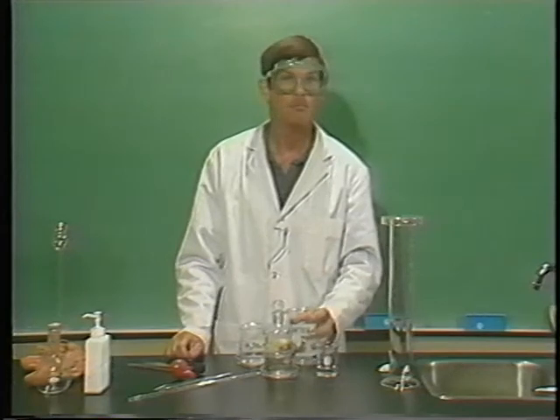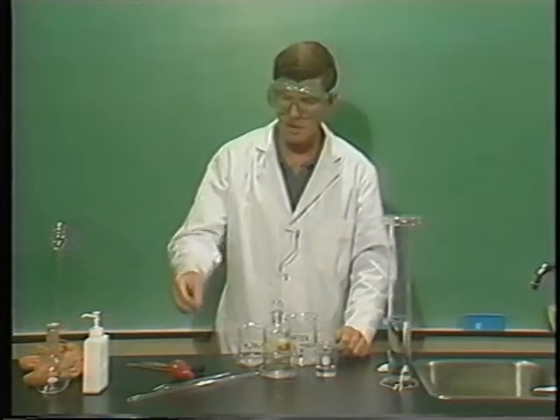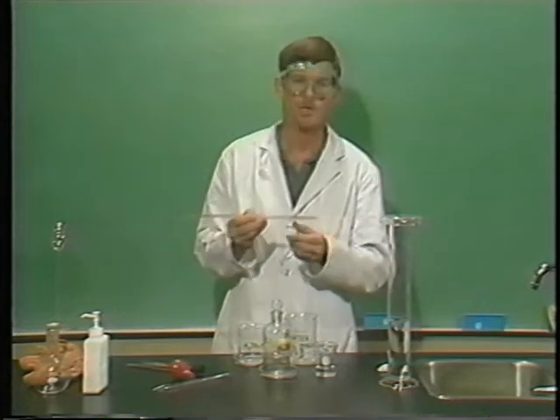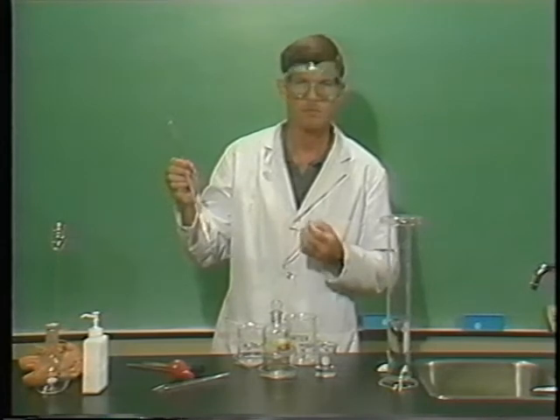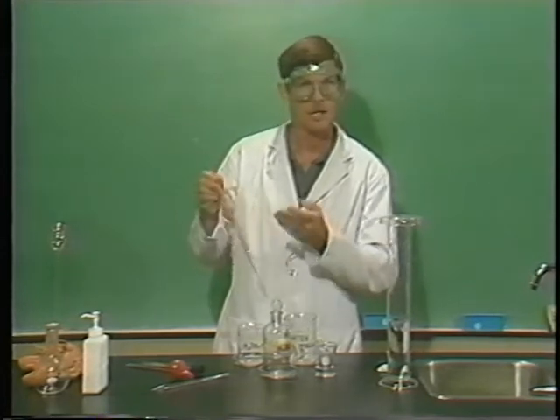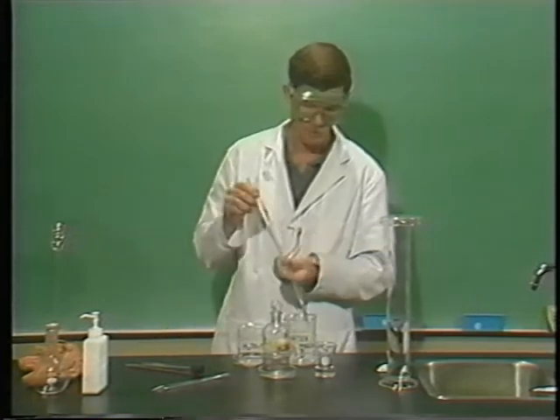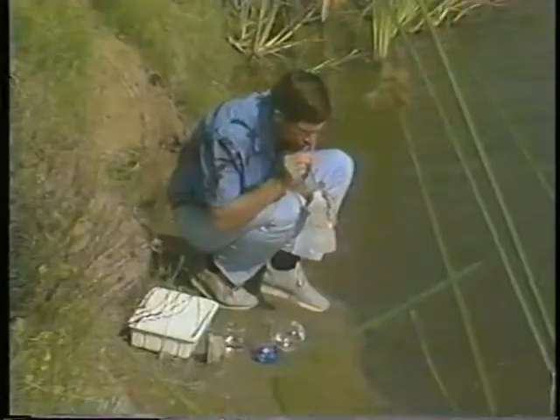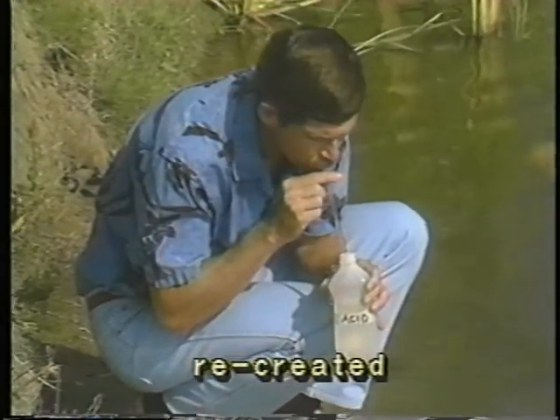Both acids and bases are very dangerous and should be treated with respect. One time I was working with some very concentrated sulfuric acid, and I was using a pipette. I had to take 1.8 milliliters of acid into the pipette and transfer it into another liquid. I didn't have one of these syringes at the time, and when I was sucking it up with my mouth, some of it actually sucked up right into my mouth, and then my teeth actually started sizzling.